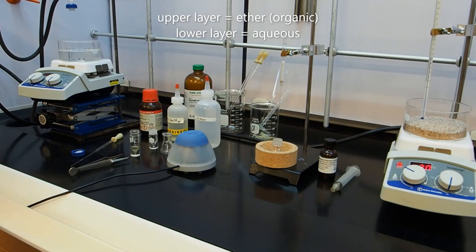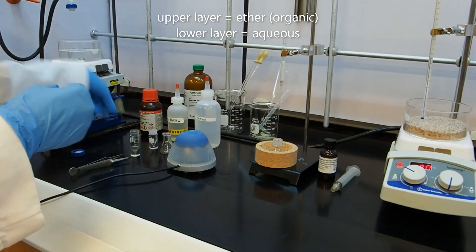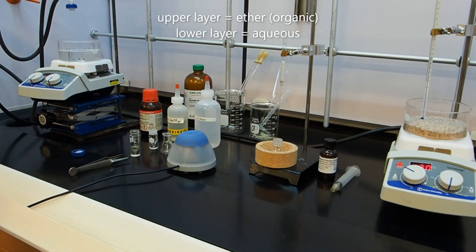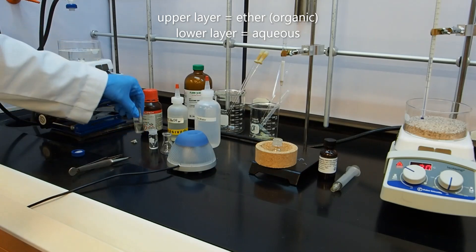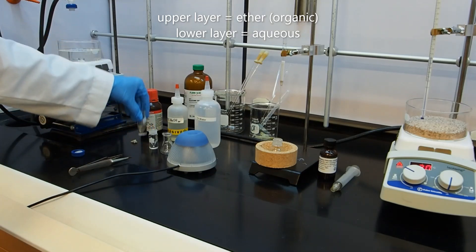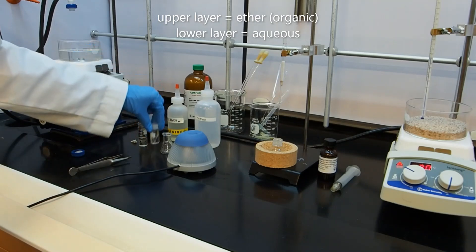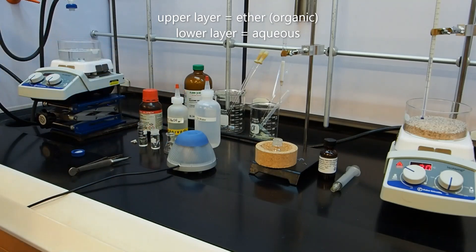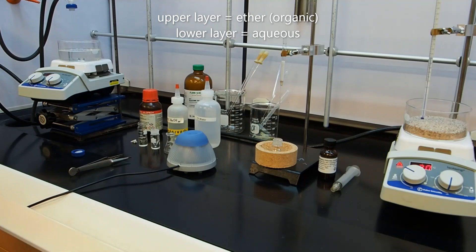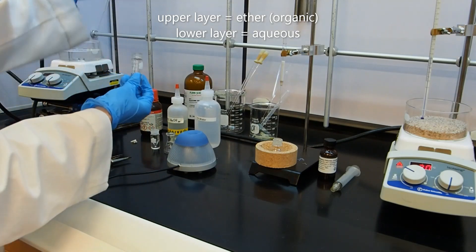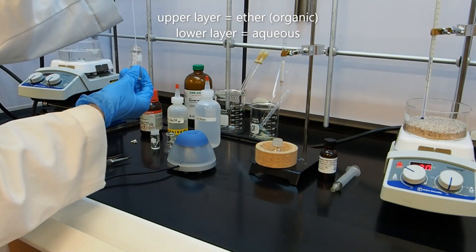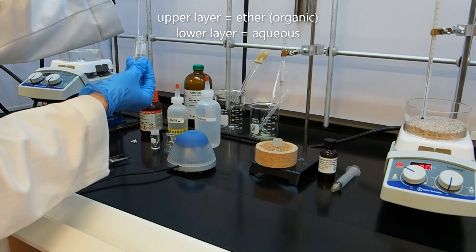We're going to use a Pasteur pipette, which I have right here, to transfer the lower heavier aqueous layer into a small conical vial. So it's kind of clever here that we have a five mil conical vial and a three mil conical vial. So I'm going to move the lower layer.